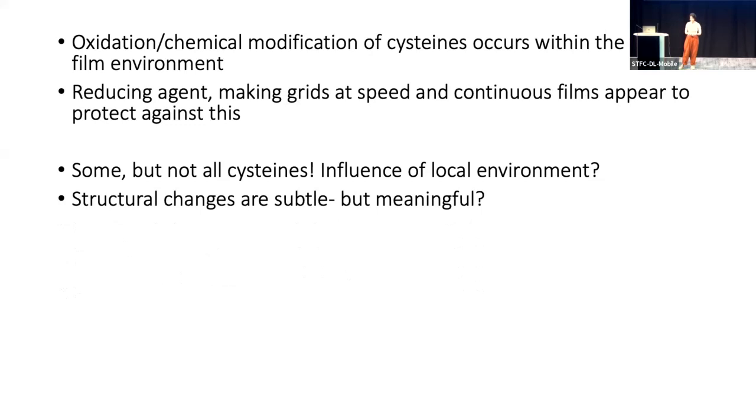The structural changes that we've seen and reported today are subtle. There are changes in rotamers, loop regions becoming less ordered, and you're not able to resolve those. But if that's the region where your Fab is binding, for example, then actually this might be really meaningful for your structure determination exercises.